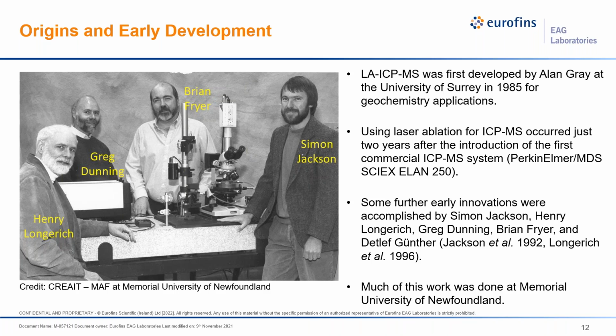Second, MUN is where I first learned laser ablation in 2011 and 2012 from the geochemist John Hanchar. So essentially, LA-ICP-MS was invented for academic geochemistry, but has since proliferated into a diverse array of fields such as forensics, archaeology, paleontology, biomedical science, industrial R&D and quality control, and failure analysis, to name just a few examples.